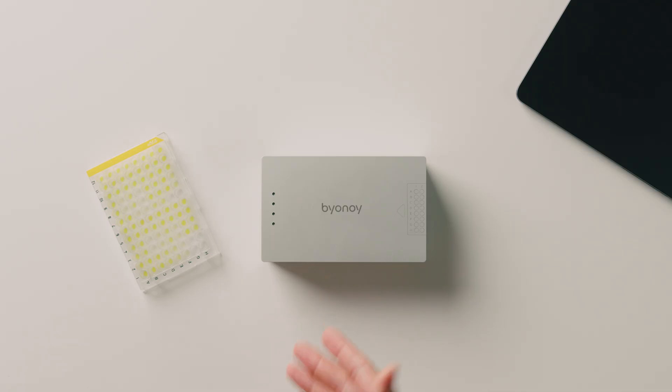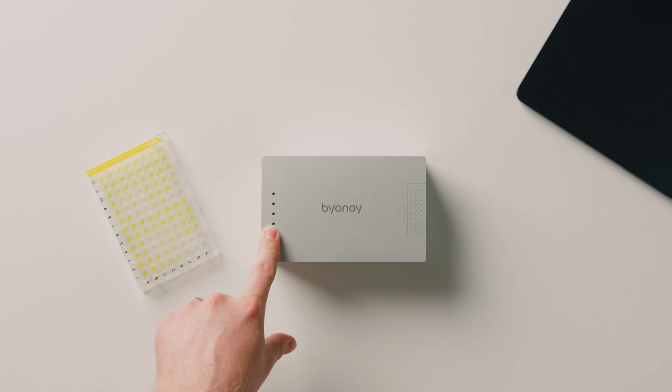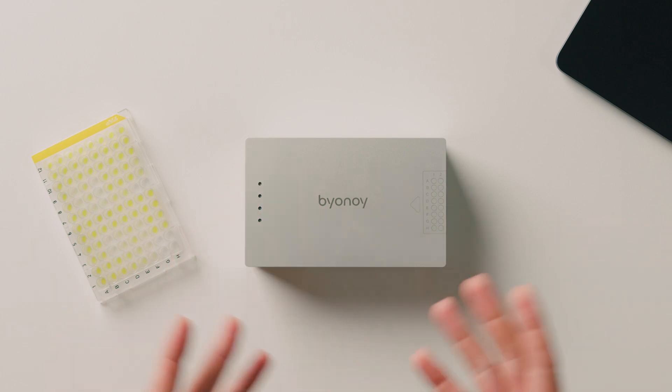How were we able to build this reader so compactly, and why are other microplate readers perhaps so large? The answer to both of those questions lies in our design concept, which begins with four LEDs at the back of the instrument. The light from these four LEDs, which are also used as signal lights for the system, is spread across a series of very finely drilled holes in the top of the instrument, referred to as light openings. This is achieved using polymer fibers — a sort of fiber optic setup.